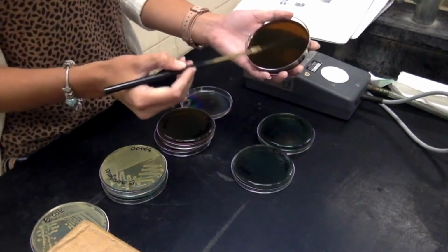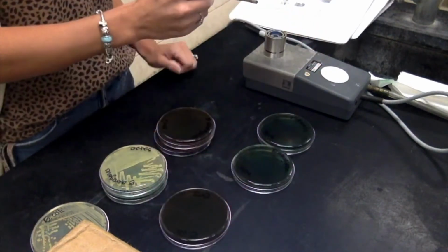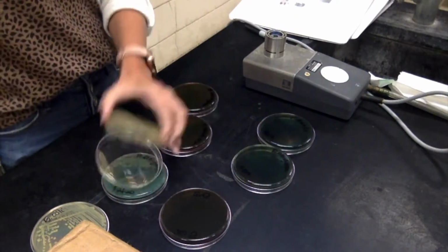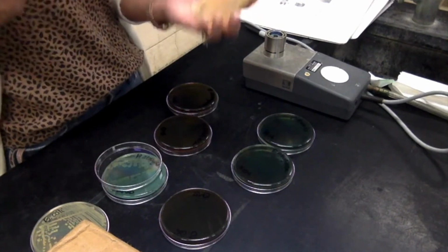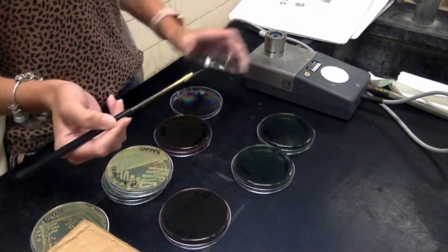Okay. That's done. Now I'm going to do my Enterobacter, and remember Enterobacter is going to give me growth, and it's just going to give me regular purple colonies. So it's a lactose fermenter and it's gram-negative.